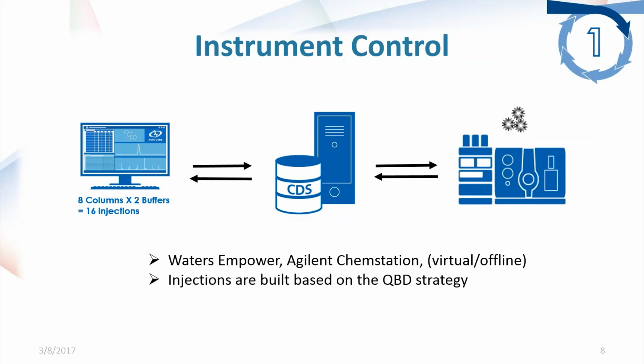The advantages of instrument control is your injections are actually built on a quality by design strategy with critical quality attributes defined upfront. This results in dramatically improved efficiency.